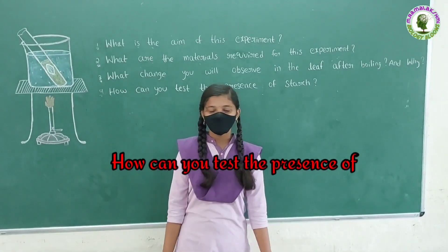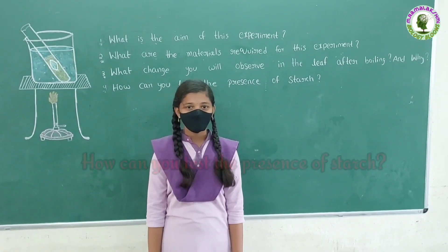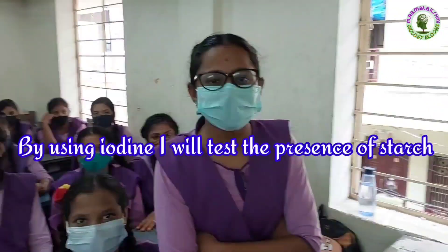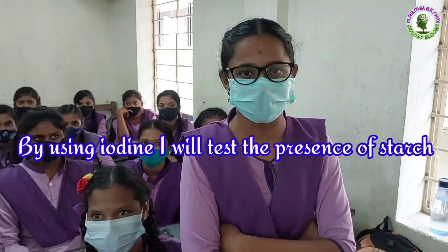How can you test the presence of starch? Madhu: By using iodine, I will test the presence of starch, ma'am.